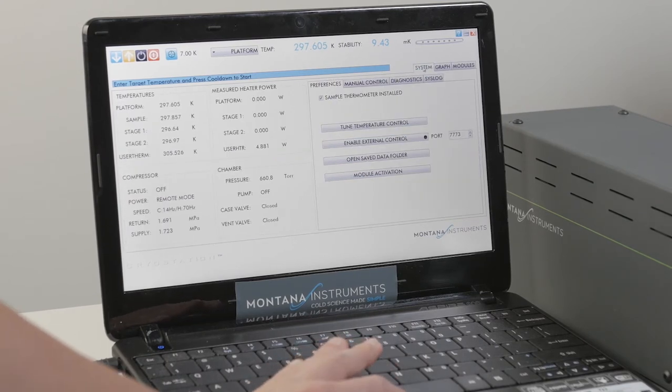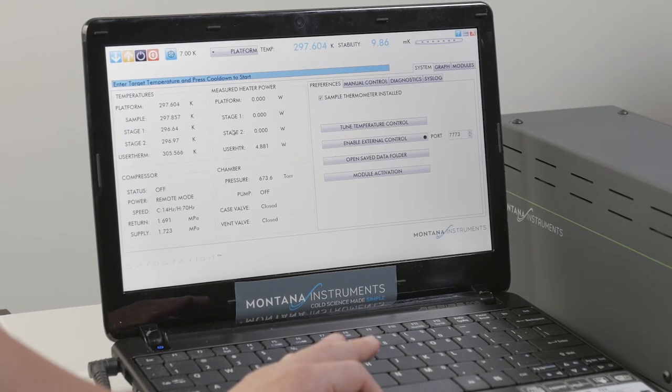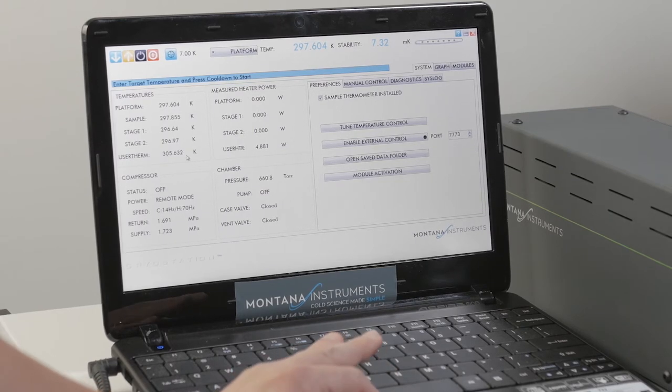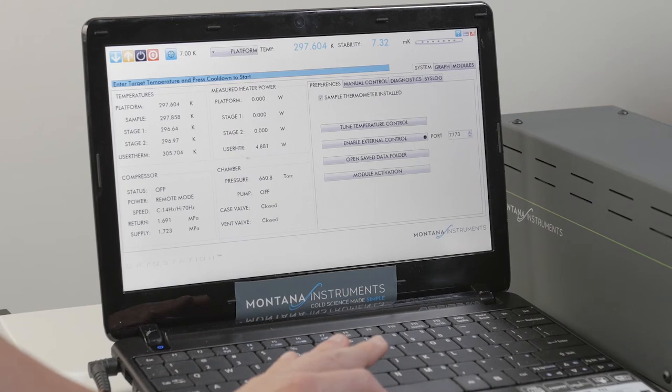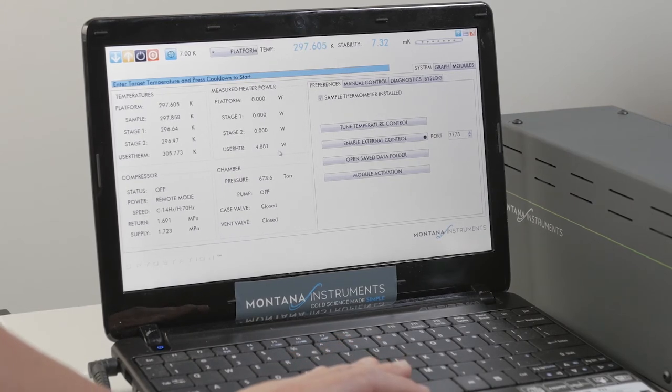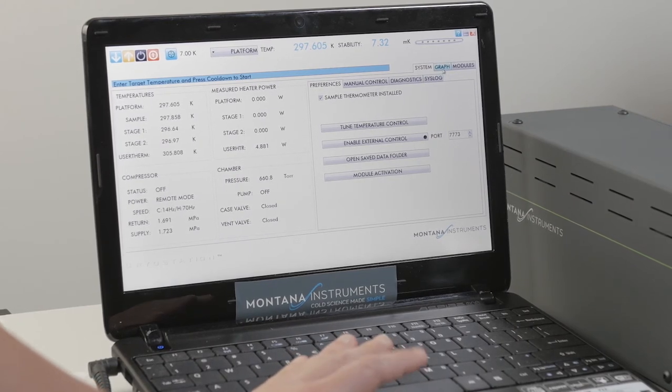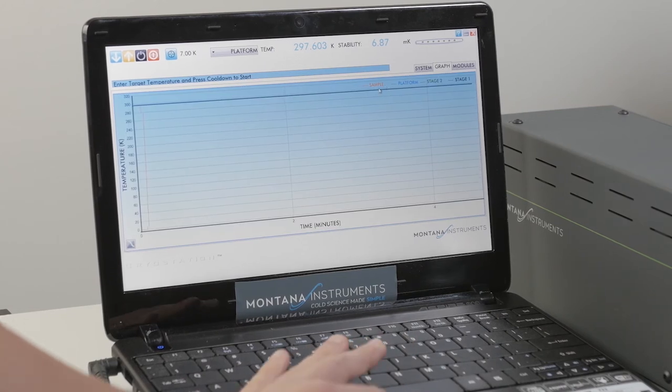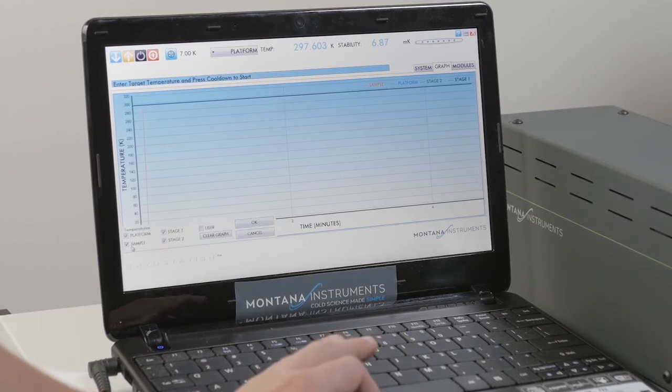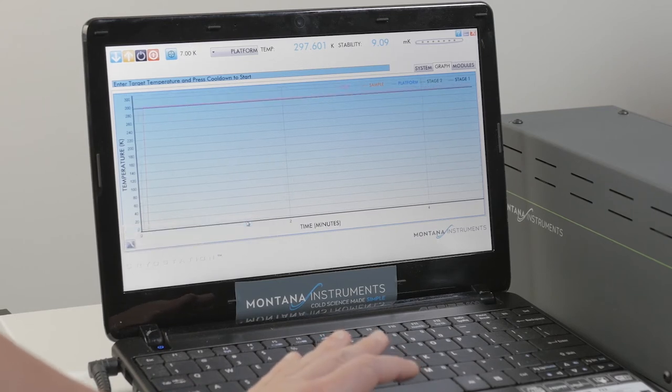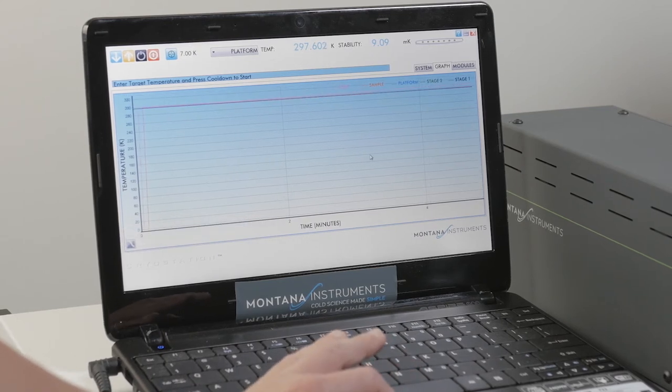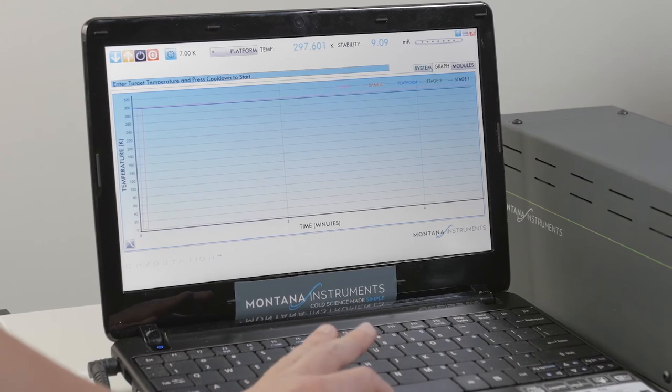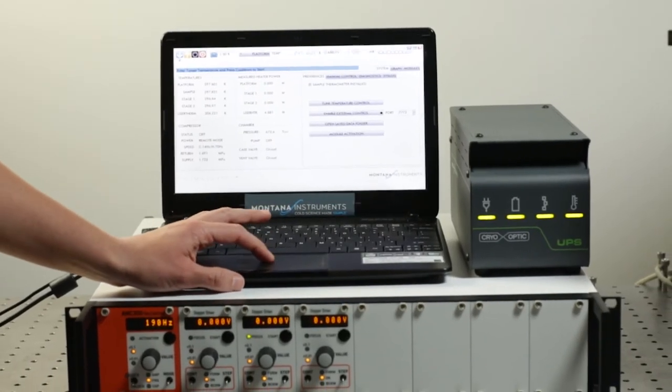Within the system tab you'll see the user thermometer which is the objective temperature and the user heater which is the output power from the heater on the objective and the graph also displays the user temperature. This will also be monitored on the cool down. Once this is all set and all the lights are green you can push cool down and you'll start to approach target temperature.